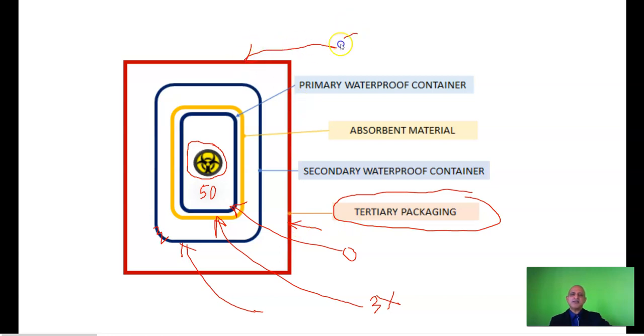It is very important that you use the appropriate labels for this particular package. Label it clearly. If it's going to cross national boundaries, please label it in the language of that particular jurisdiction. Or else your labels in English or French or whichever language you have used at the origin may not be deciphered in the country of the recipient. So this needs to be taken into account.